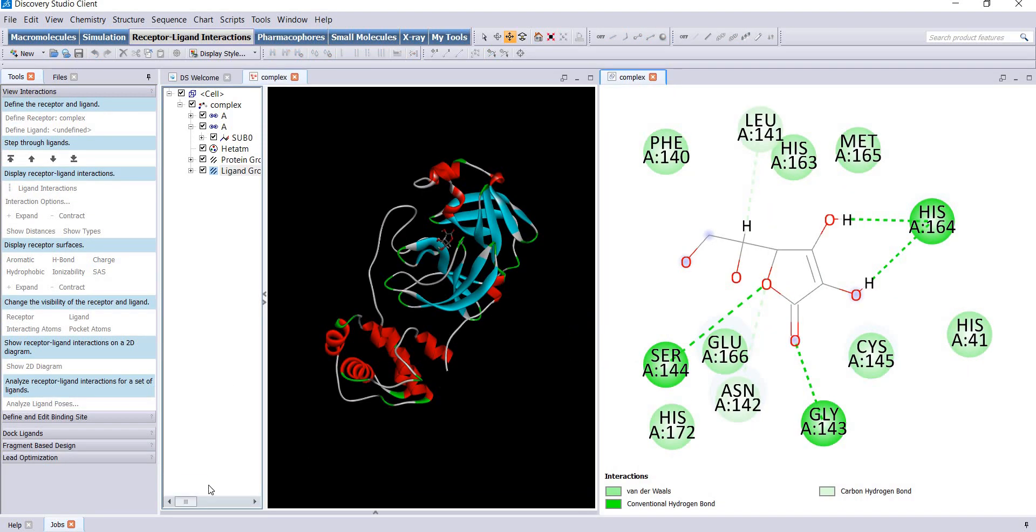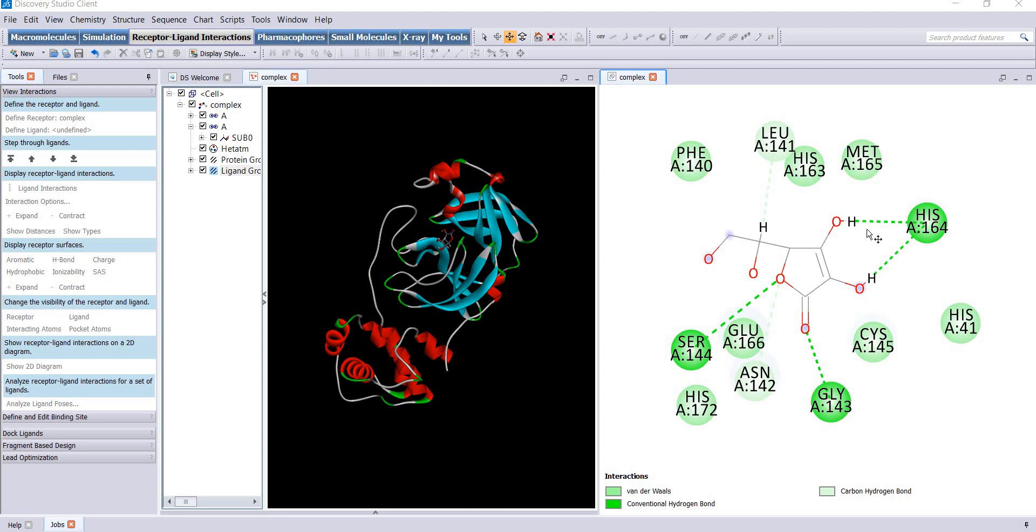You will find this 2D image where several molecular interactions are given. Here is the panel which shows what type of interactions are given in what colors. We are interested in conventional hydrogen bonds which are given by dotted green lines.